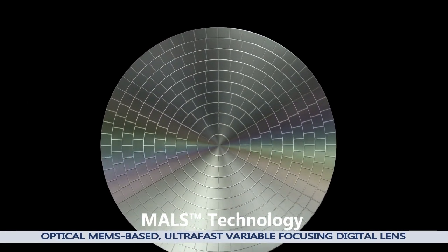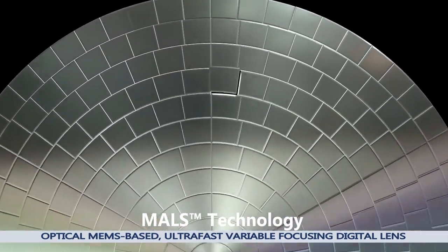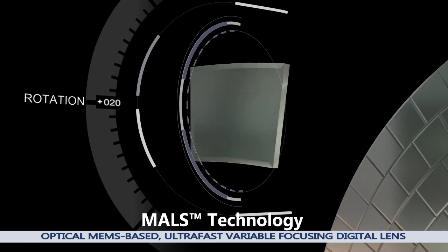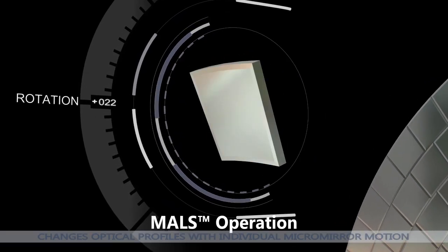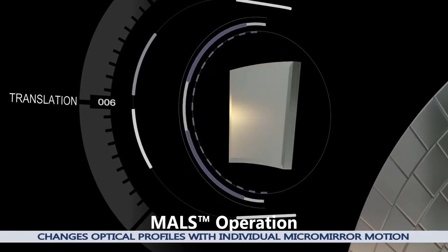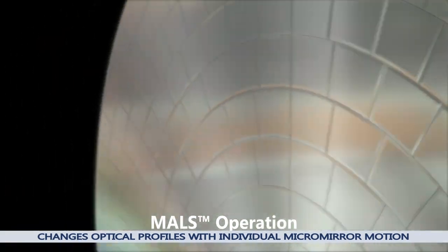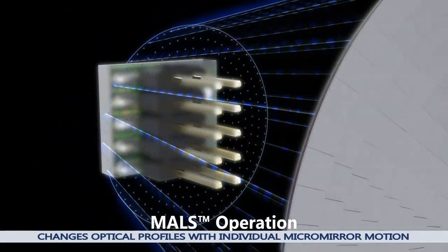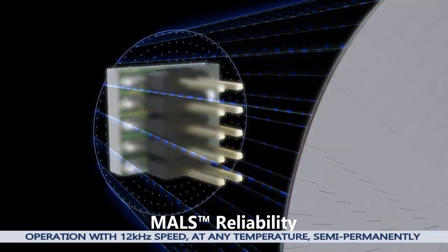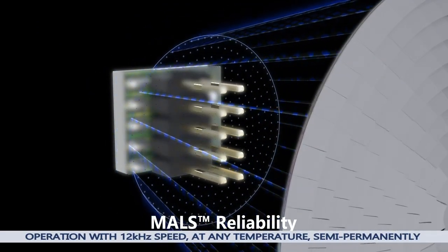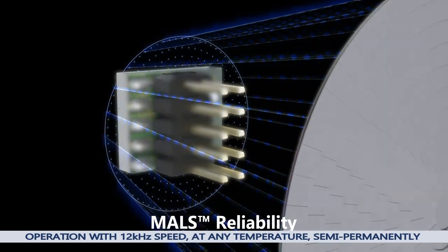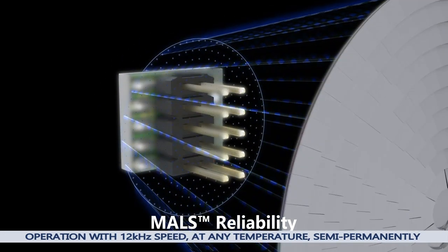MALS is an optical MEMS-based ultra-fast variable focusing lens that implements curvature changes in the lens with the motion of individual micromirrors. MALS moves and focuses at the speed of 12 kHz without z-axis mechanical movement. It is a semi-permanent digital lens technology that operates at any temperature and has no life cycle limit.